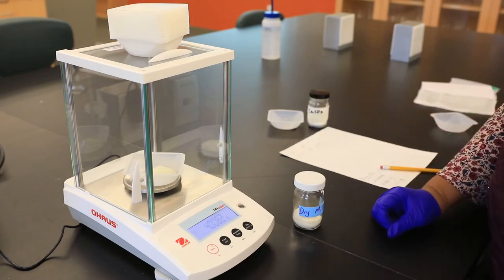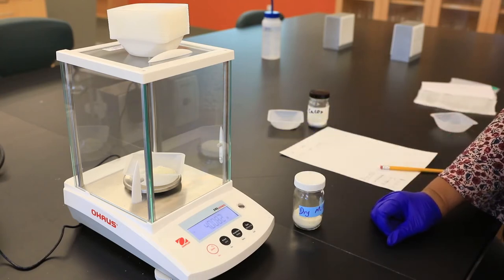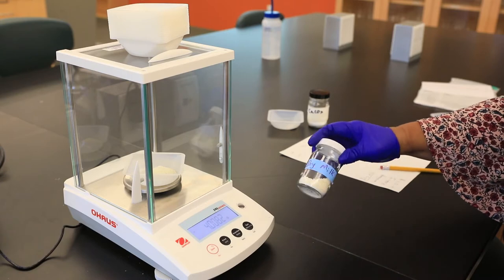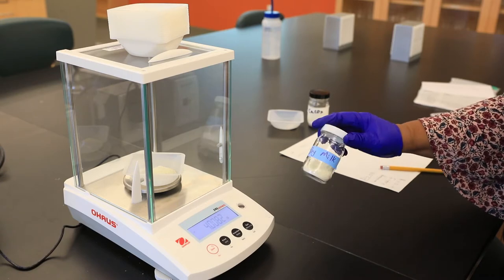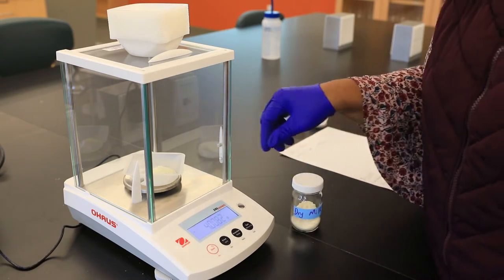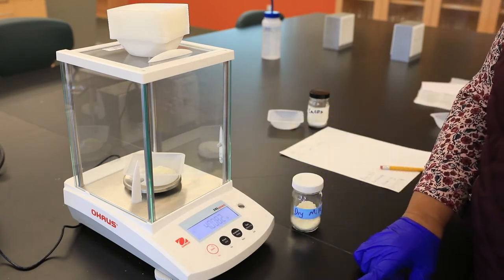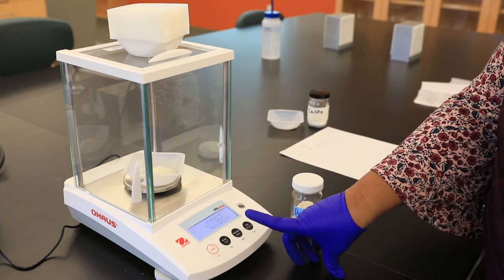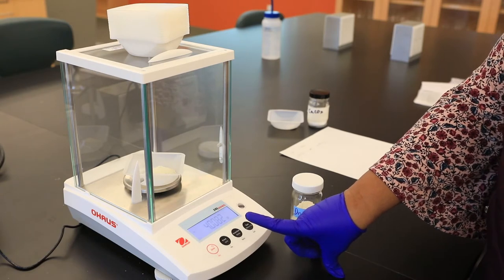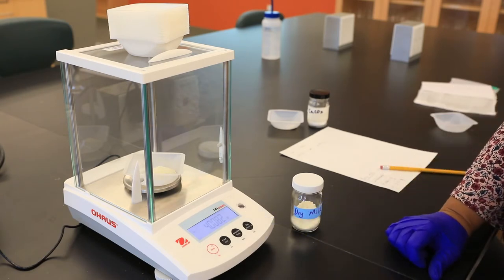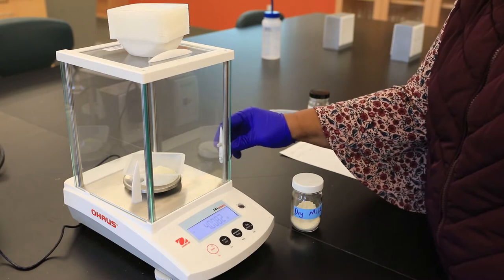In this lab, our goal is to isolate the protein casein from milk. We're using dried milk, and I've pre-weighed the amount needed - approximately 4 grams. You can record this value down: 4.008 grams of dried milk.